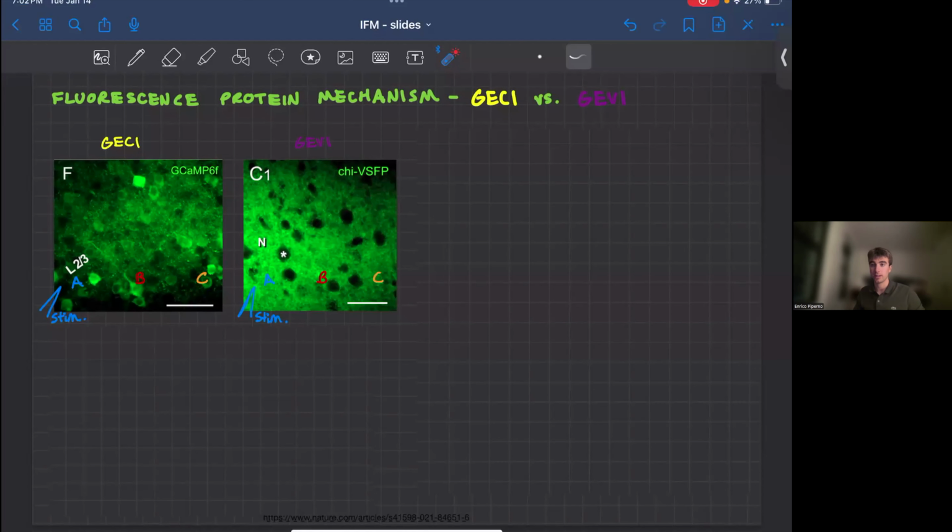The two main fluorescent indicators of neural activity are genetically encoded calcium indicators and genetically encoded voltage indicators. These indicators are constantly evolving to result in higher brightness and faster kinetics. And by evolving, I mean engineering. As a result, the information on this slide represents a window into the current progress of these indicators. For instance, here is a picture of GCaMP6F, 6 meaning the 6th version, F meaning the fast version. In any case, here we'll be discussing the differences in dynamics between these two sensors.